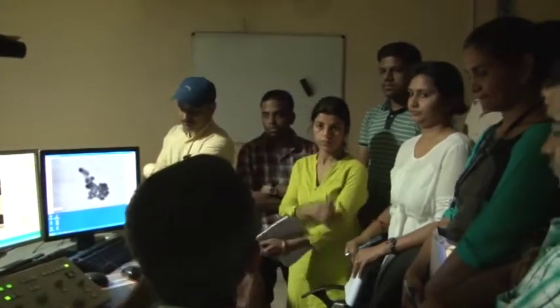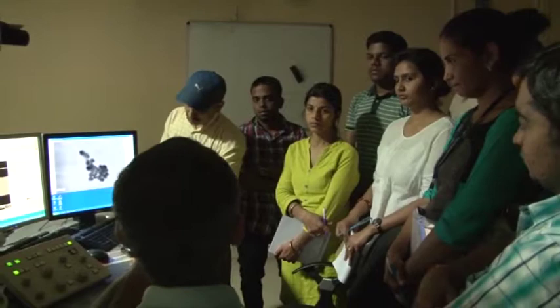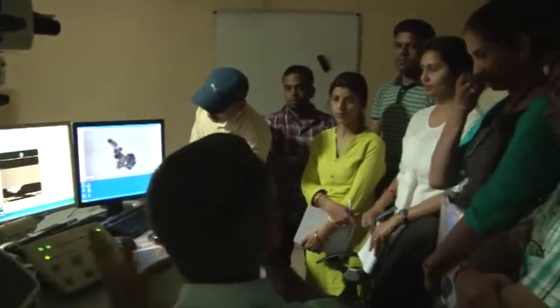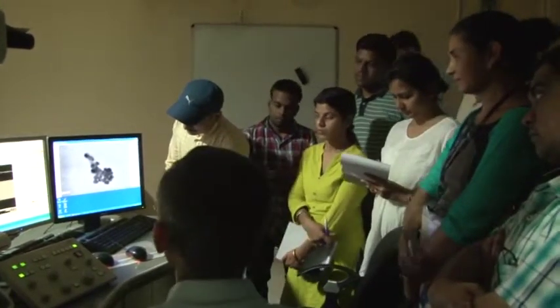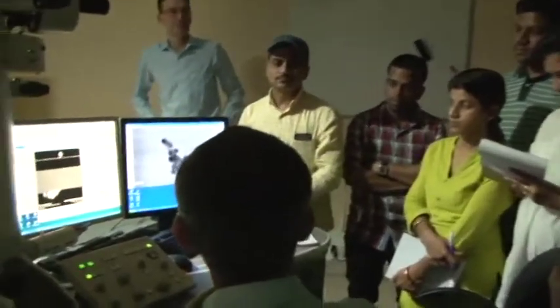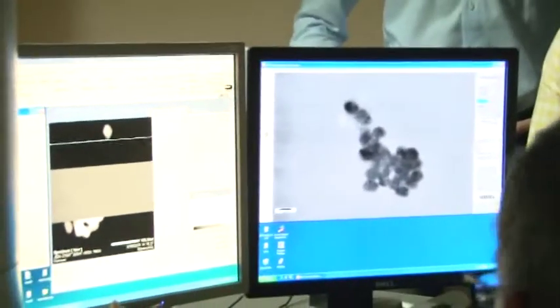If it converges, then most of the intensity is concentrated in a smaller area, so the intensity of the beam will increase. If I do the other way around, then it becomes more broad, but the intensity decreases. So that's what we have done. Now we are seeing these nanoparticles. Let these be our regions of interest, and we will use them to do the alignment.